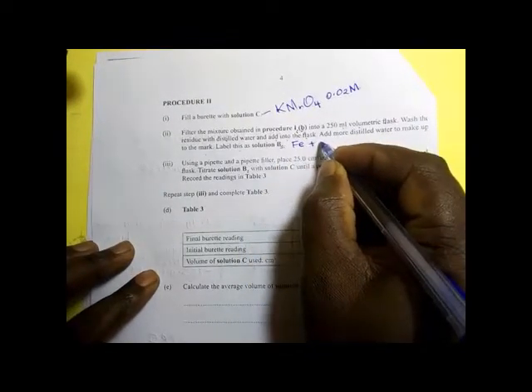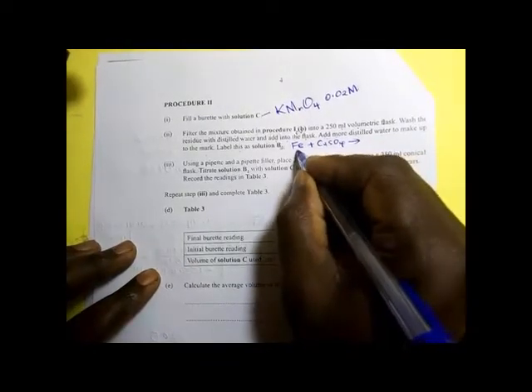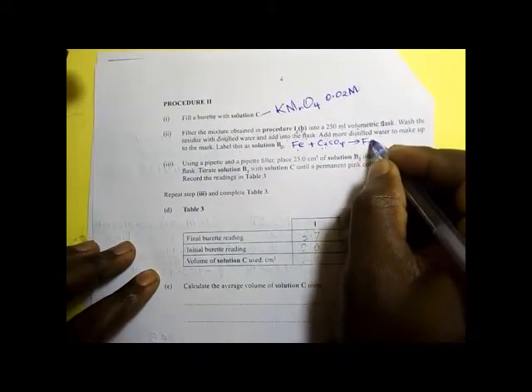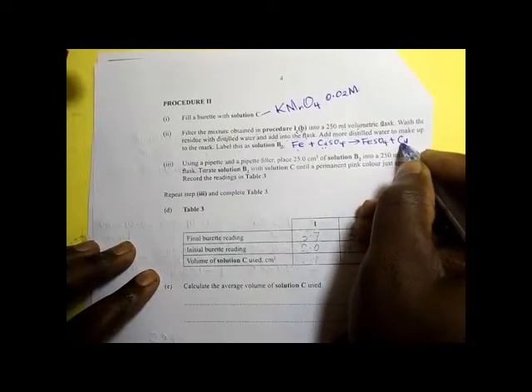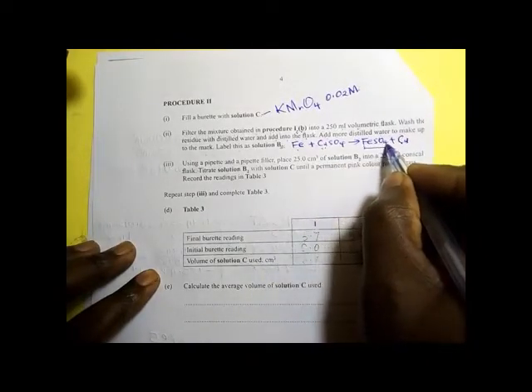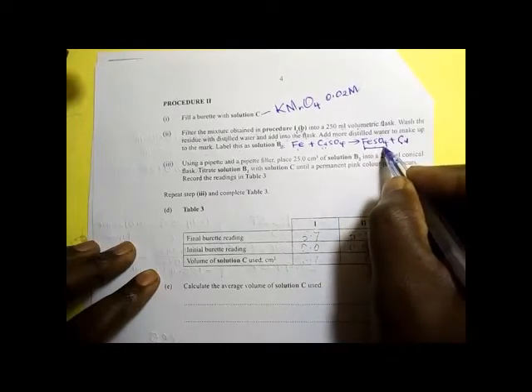Iron will react with copper 2 sulfate, whereby iron is more reactive than copper, therefore it will displace copper to form iron 2 sulfate plus copper. Copper will be displaced. So now we have this solution. We have filtered this solution, iron 2 sulfate.